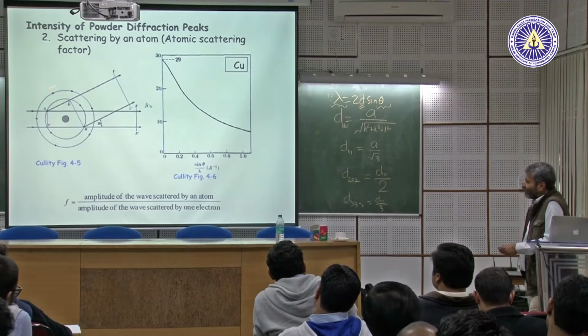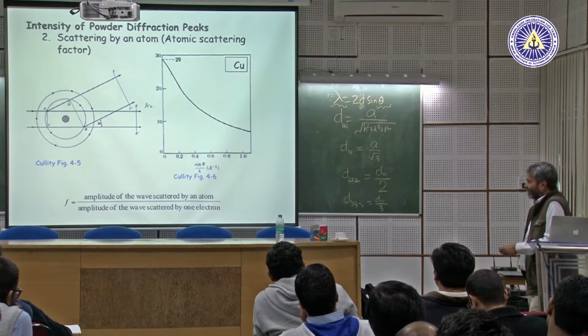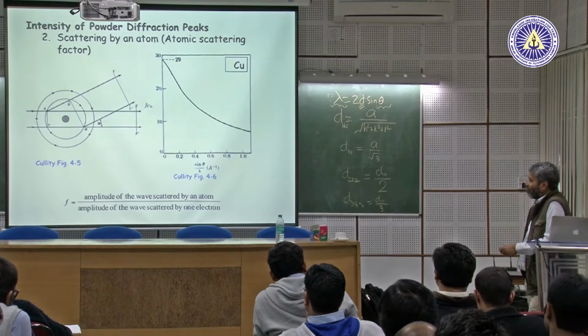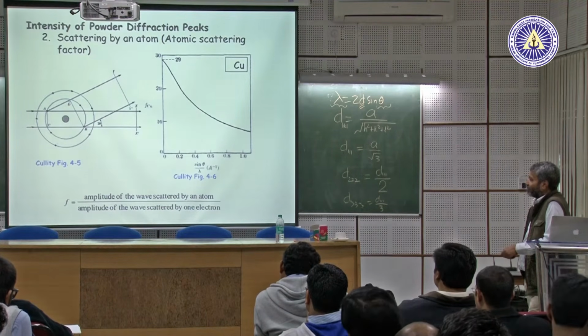So, because of the electron's position inside the atom, again a direction dependence of phase comes in. In the straight-through beam all beams will be in phase, so you will get strong diffraction, whereas in any other direction they will be out of phase depending on this 2 theta.